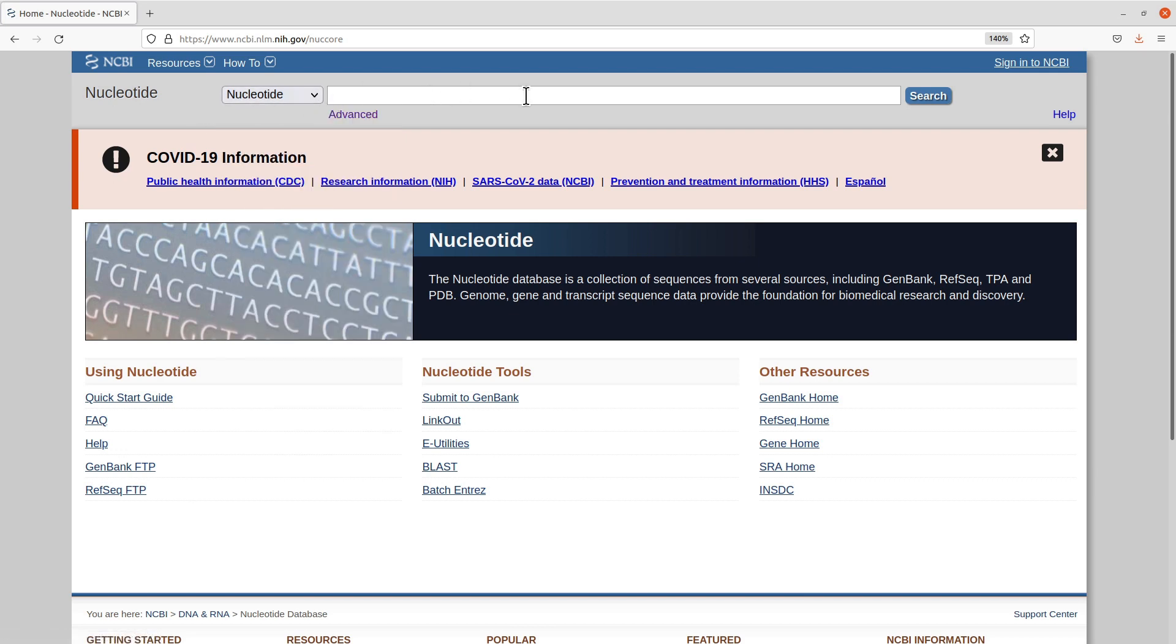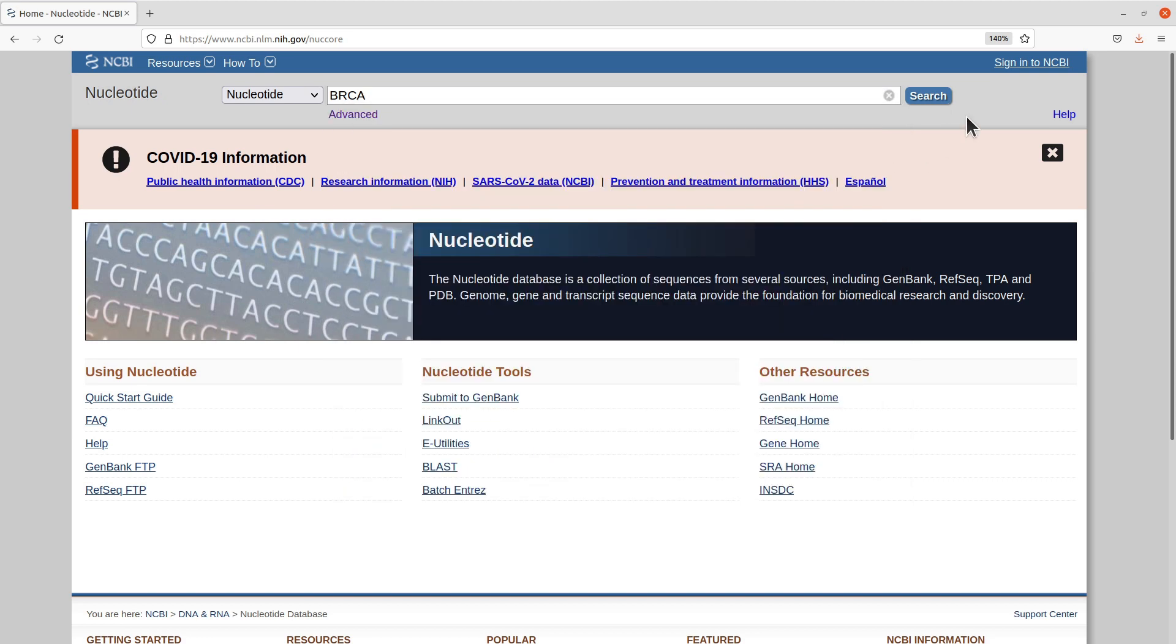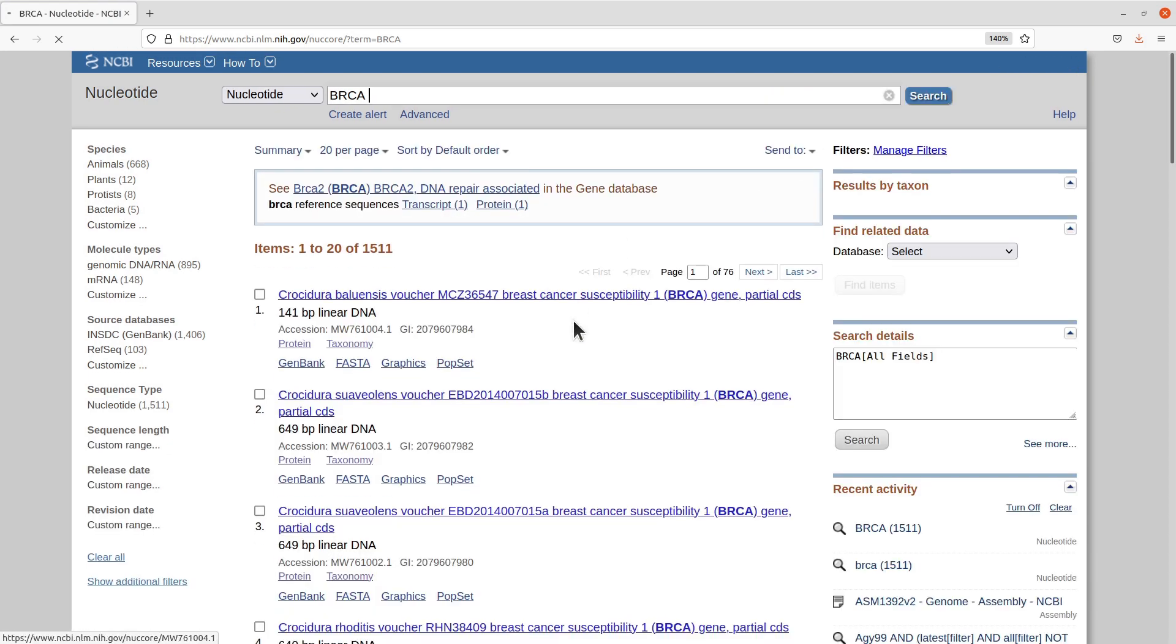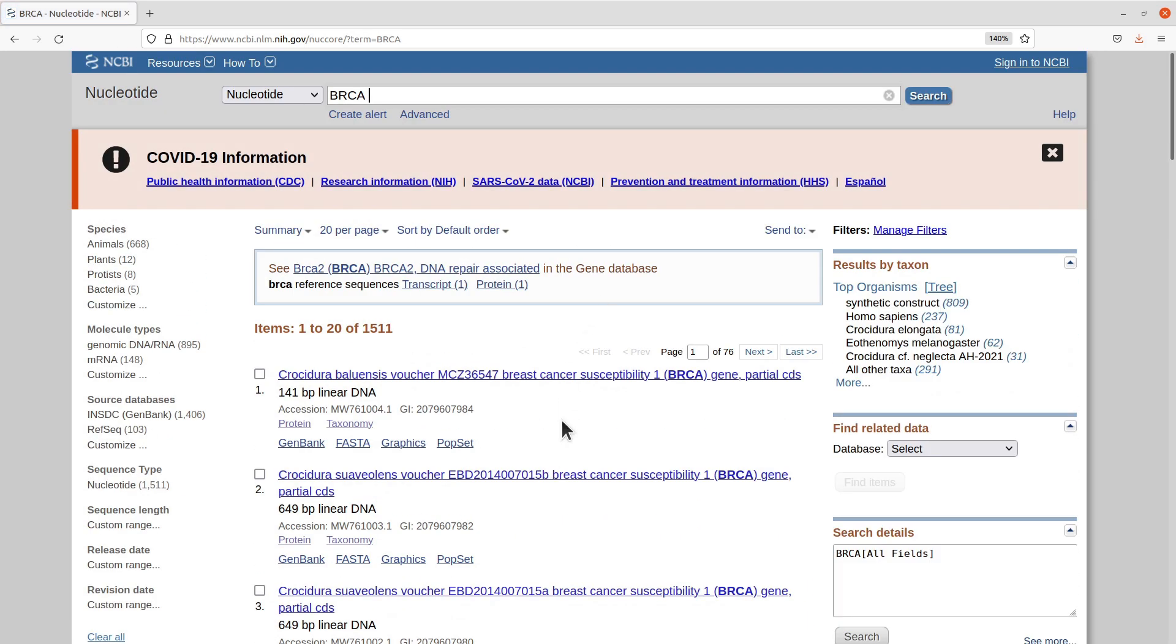I will search for an example sequence here. I will use the BRCA gene. So this is the term. I will search by clicking this search button here, and then I will have some hits coming up.